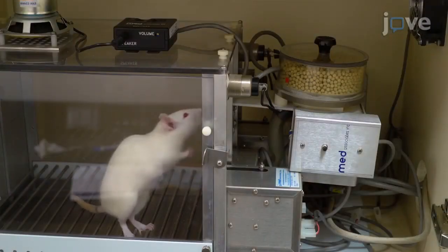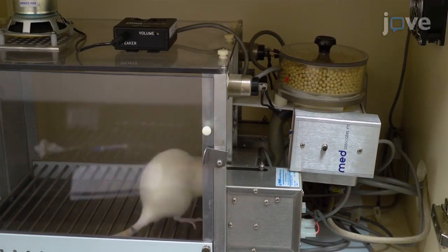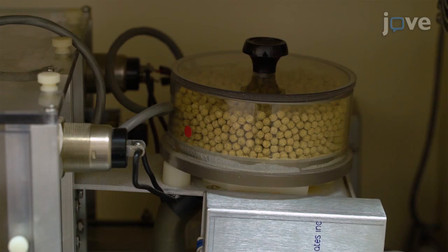After the habituation stage, introduce the rats into the conditioning chambers for 2 additional daily 30-minute sessions of delivering a food pellet every 45 seconds to help the rats identify the source of the pellets.